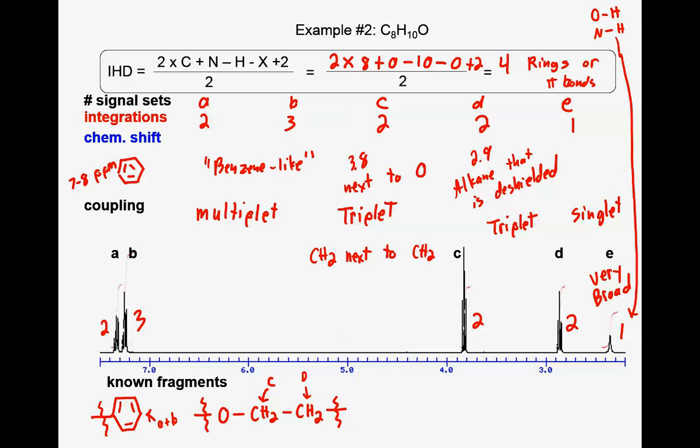Furthermore, these protons that are connected to an atom like oxygen or nitrogen don't always show up. Sometimes they're just never there. Part of the reason is that these are acidic protons. The pKa of this top one is going to be 16-ish or so. Because they're acidic, they undergo exchange. If it's in water, it could be undergoing a chemical change, so sometimes it just doesn't show up based on the environment it's in.